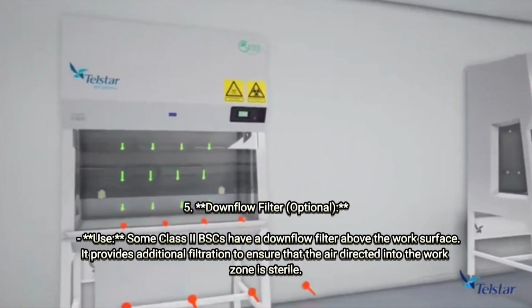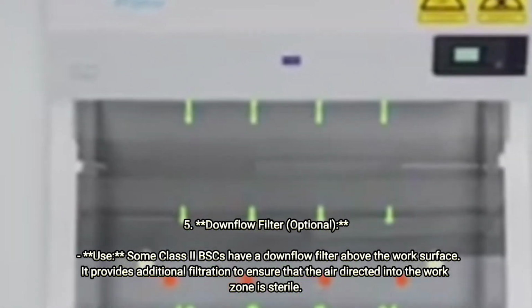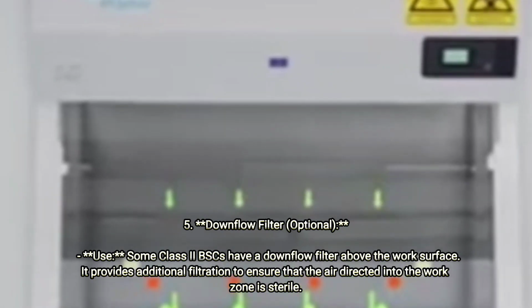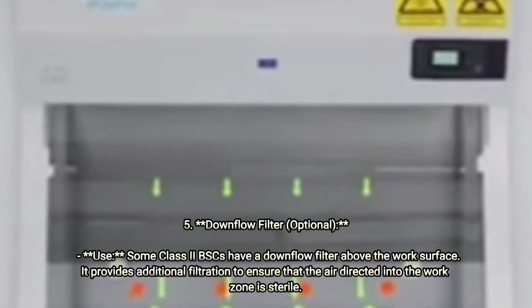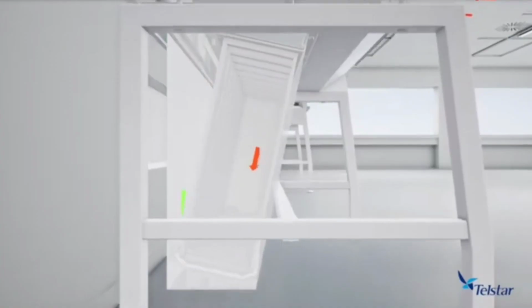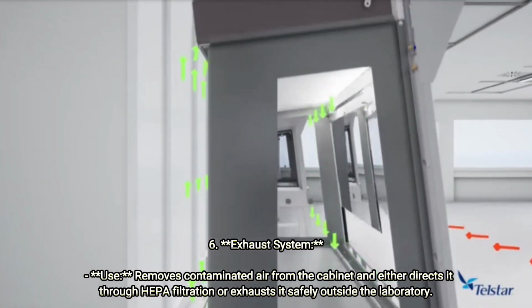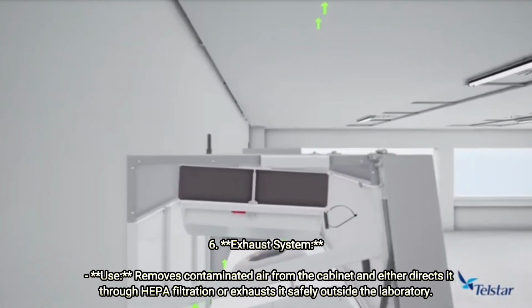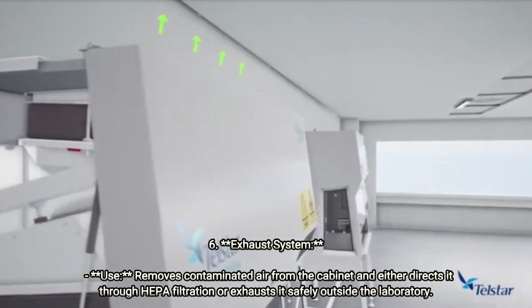Fifth is the downflow filter, which is optional. It is used in some Class 2 biosafety cabinets that have a downflow filter above the work surface. It provides additional filtration to ensure that the air directed into the work zone is sterile. Sixth is the exhaust system. It is used to remove contaminated air from the cabinet and either directs it through HEPA filters or exhausts it safely outside the laboratory.